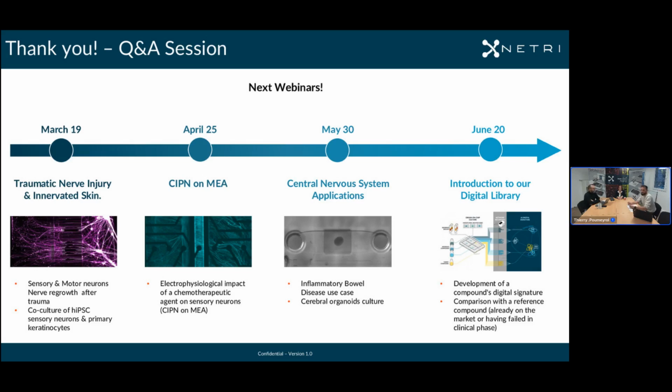Okay, very good. There is a question that was part of another question, but let me re-ask it the way it is formulated. To allow the growth of the neurite endings, do you need to add specific drugs in the compartment without cell bodies? No, we don't. However, if you want a drug that really enhances neurite growth as a control, we have tested some neurotrophic compounds and can advise on that. But it's not required. As a baseline, it's not needed.